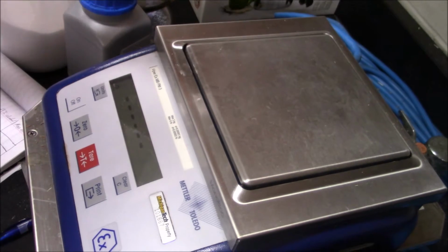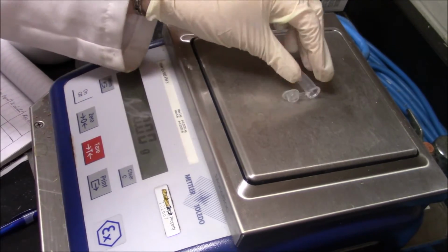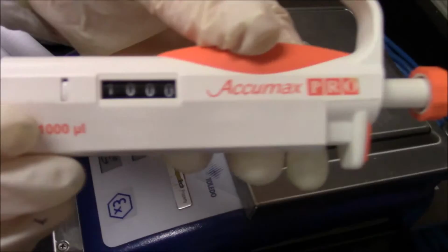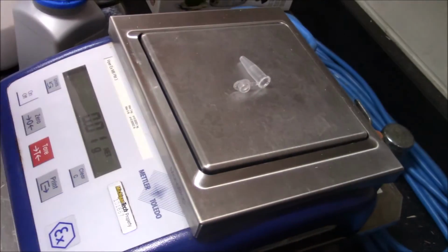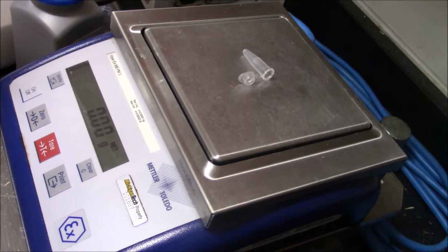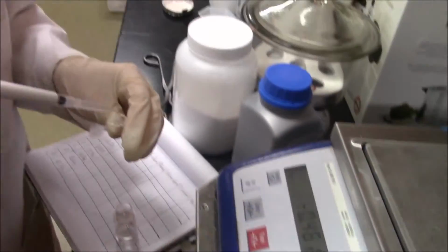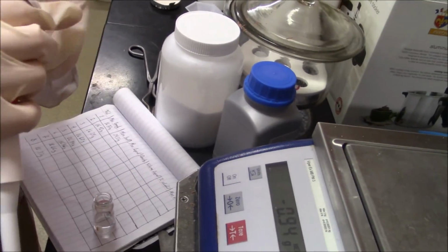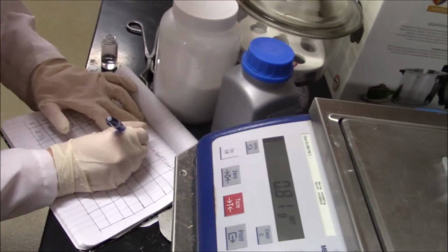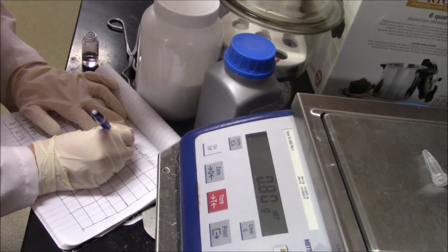Complete the chart. This is done by first massing the full vials and determining the mass of the liquid by subtracting the empty vial mass from the full vial mass. Then, take 1 milliliter samples from each flask using the 100 to 1000 microliter pipette. Place the samples into plastic centrifuge tubes and mass them using the scale. Remember to mass the empty centrifuge tube first and then zero the scale so as not to include the mass of the container in your calculations.